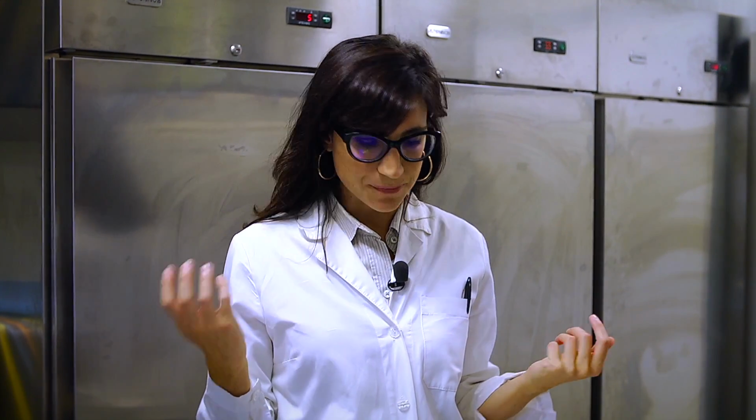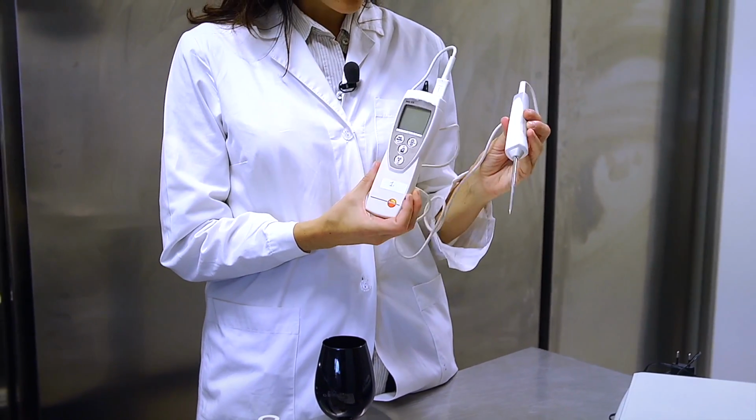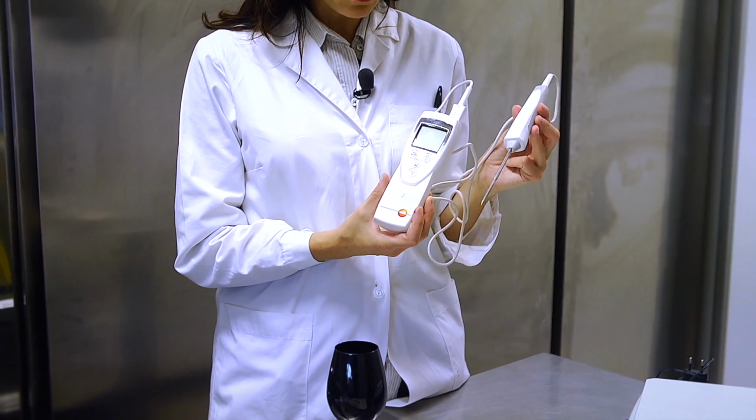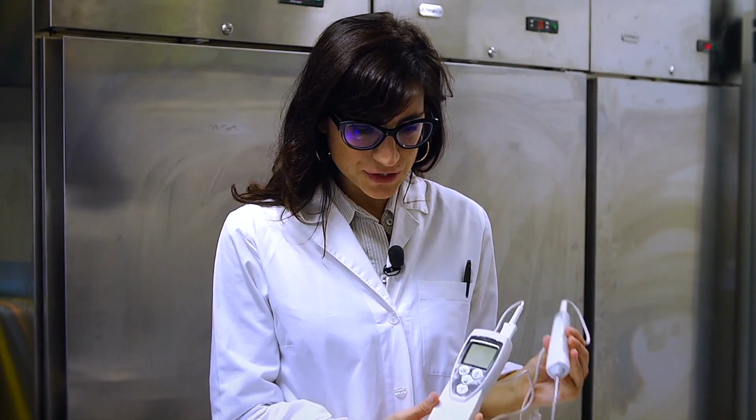Why? Because if something is very hot, the release of aroma would be very high. Instead, if a beverage or a food would be very cold, the release of aroma and the overall perception would change. To do that, we often could use instruments like this that measure the temperature of a food or a beverage.